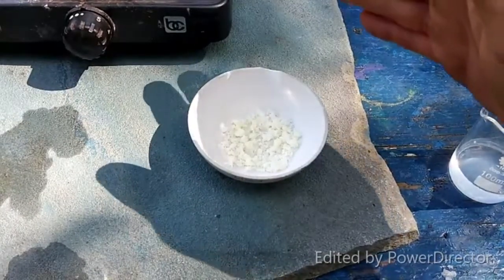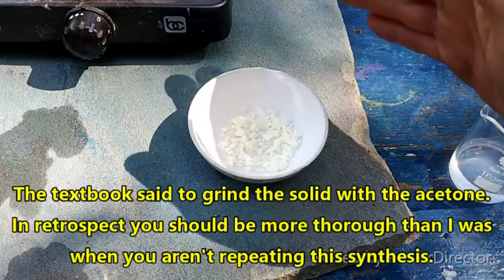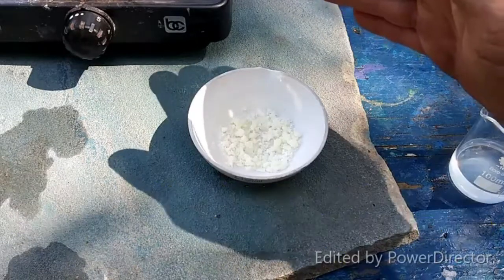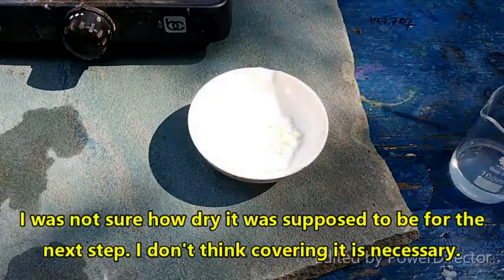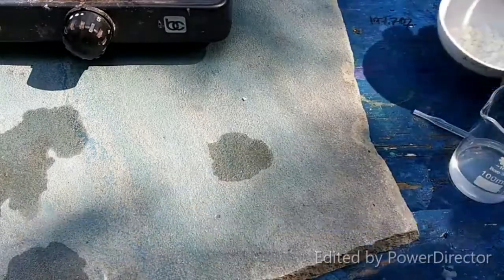You can see it — it's kind of a very pale yellow solid. Now we have to reflux this in ethanol for half an hour. It has to be 120 ml of 95% ethanol and 30 ml of water. I am going to get that ready and cover this with plastic wrap to make sure not too much of the acetone evaporates.